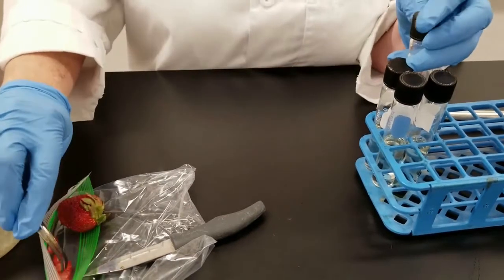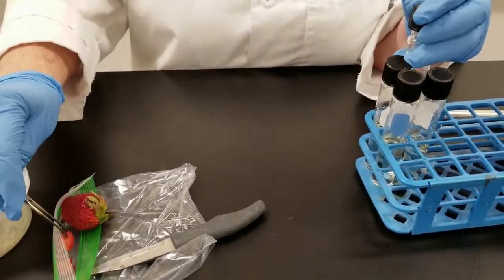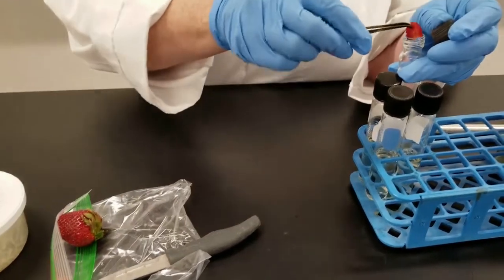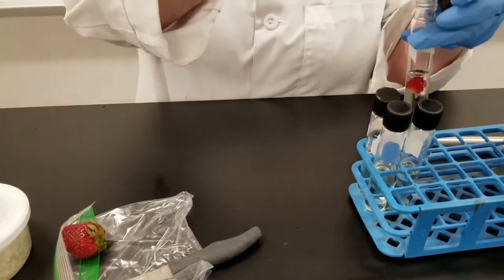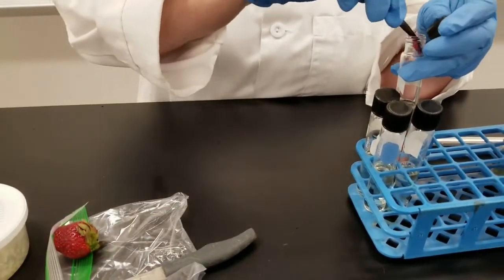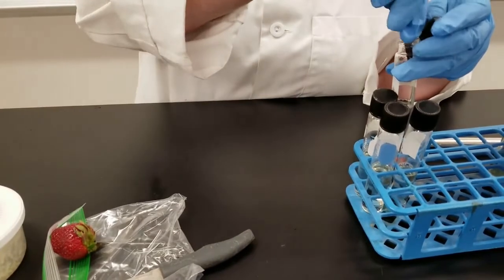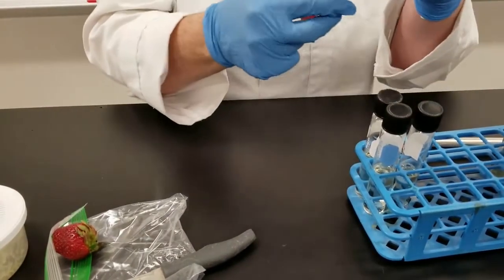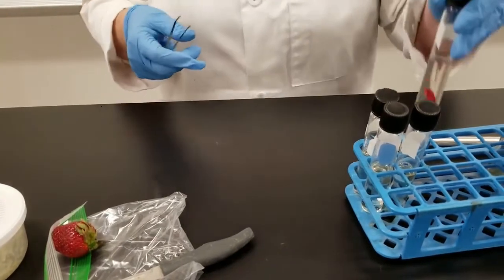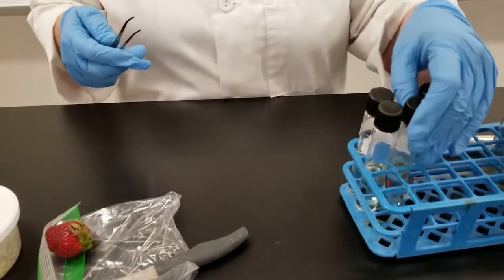What I'm going to do is combine sort of food microbiology with fungi. We're just taking some fresh strawberries, and I'm just going to drop a couple pieces into the Sabouraud agar, which is an agar that is for fungi. It has a lower pH, and so we will see if we get any growth.